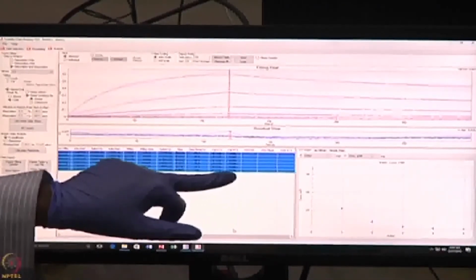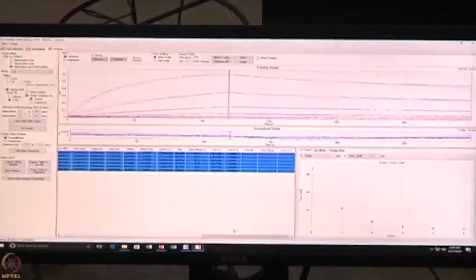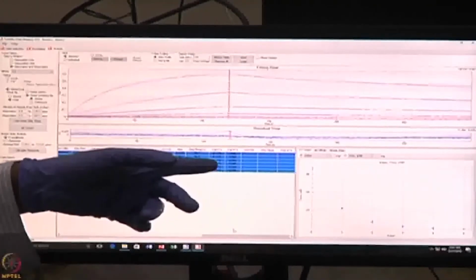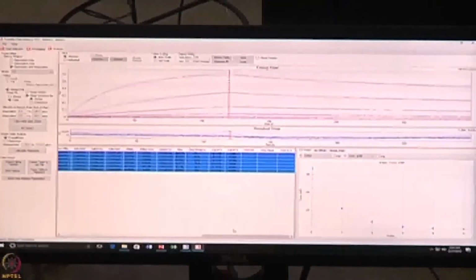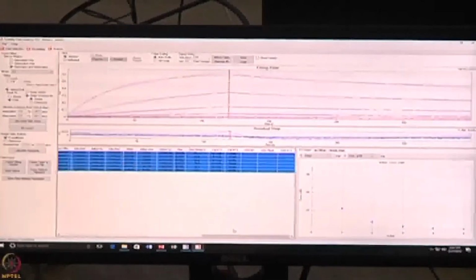And how significant is my fit? It is the goodness of the fit and significance of the fit. There are 2 parameters. We have one more statistical parameter called chi-square. My chi-square should be less than 3. I am getting around 0.12. So the fit is good. So when your R square is more than 0.95, automatically your chi-square also comes down.